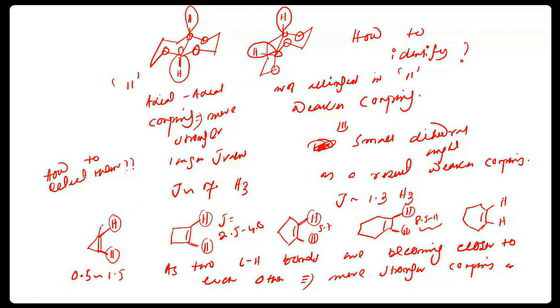See, the bond is projected here in this direction. These are the directions. Look, if we say this is the cis bond, these directions. Once this is a 4-membered ring, look at the bond, these directions.